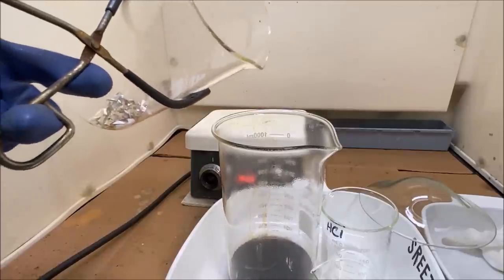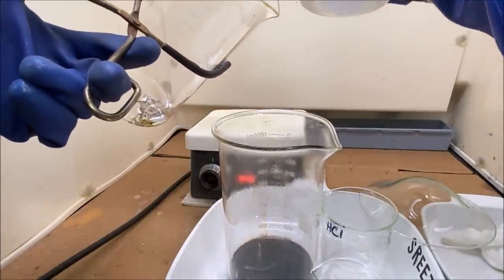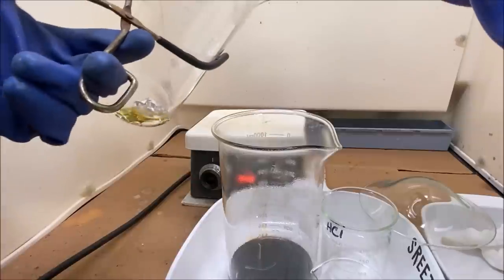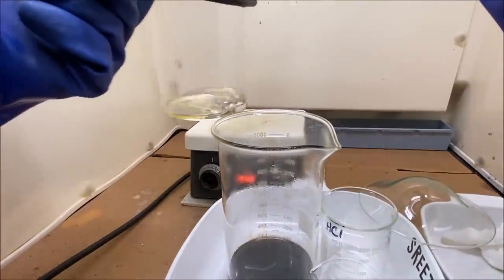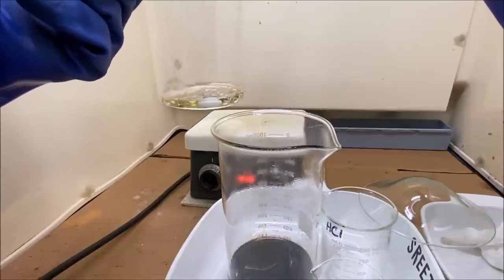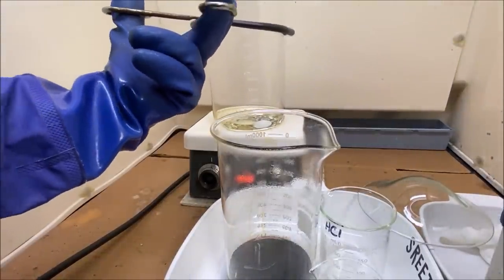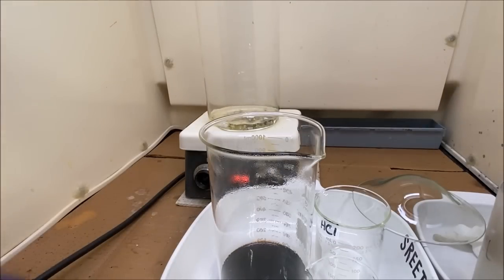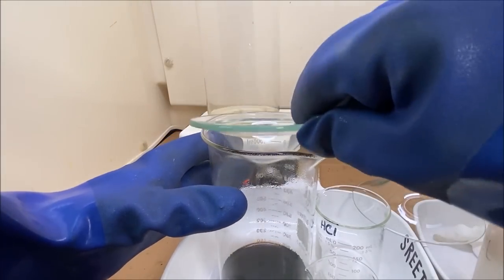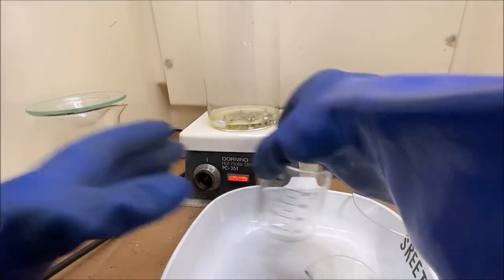Now what we're going to do is put a little bit of the... Let's see, I think we can add some hydrochloric from our squirt bottle here. Only about half of the platinum's dissolved. See, there's plenty in there still. Set this back up on the heat. Now I think what we'll do is get this out of the way. Just gonna set it off to the side.